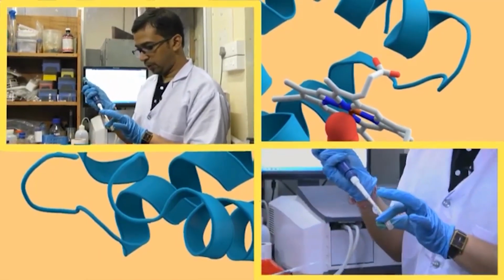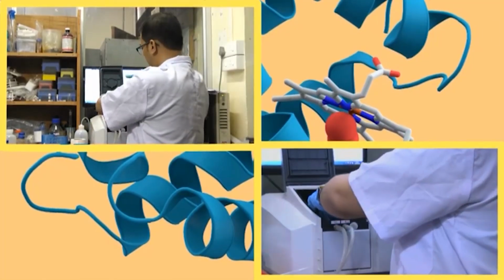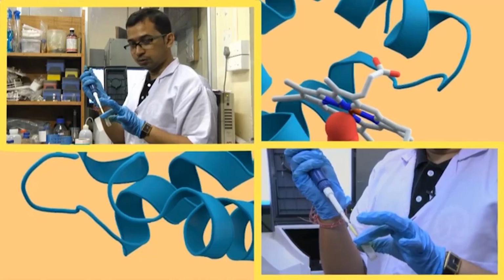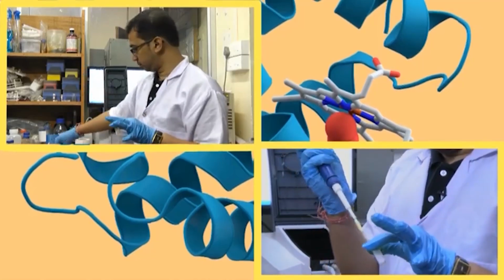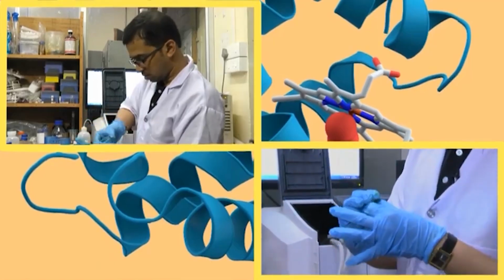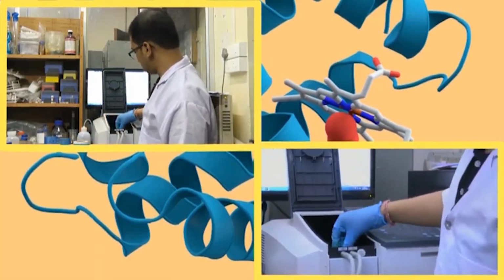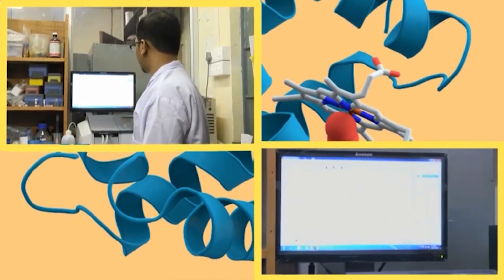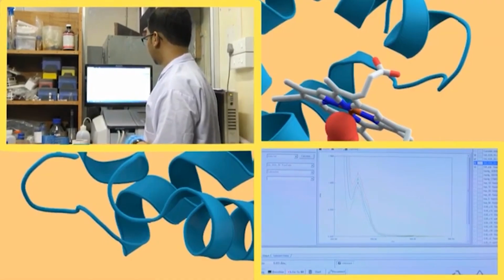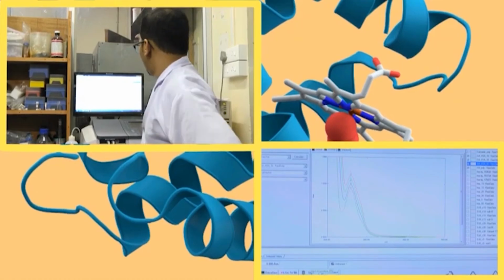Now, I will be taking 20 microliter of HSA, and please remember to use the same HSA solution for sample and control. Do not change the HSA solution or the concentration. This is for 50. Auto 0, and now starting this one.